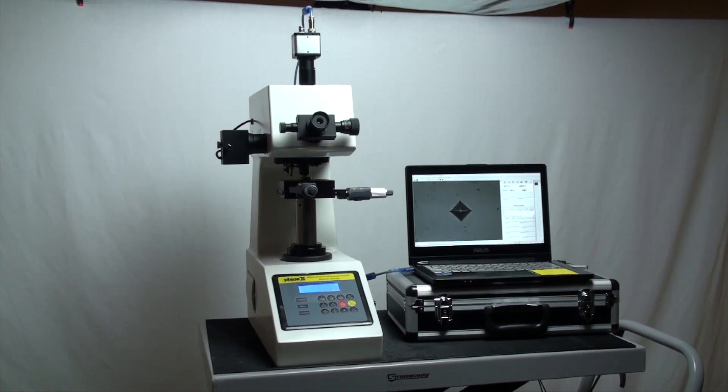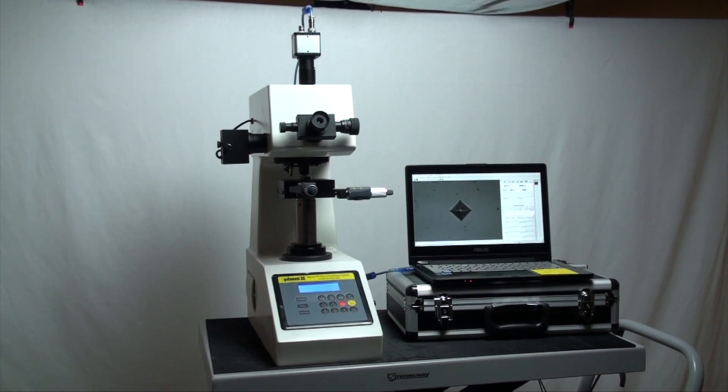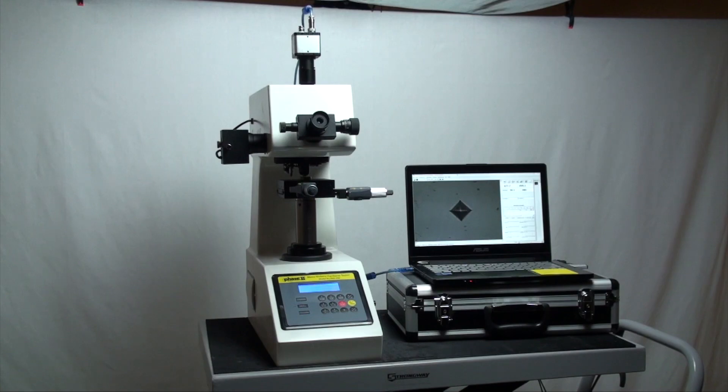Now let's move over to the operation of the hardness tester and see how easy it is to utilize the different functions, taking tests and obtaining results.